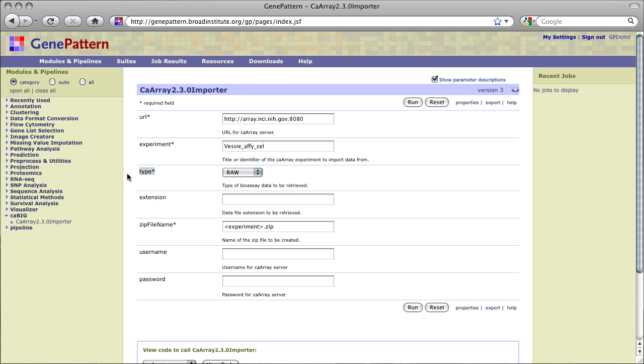Type refers to the type of bioassay data to be retrieved, raw or derived. The default is raw and will likely be correct for most data imported from CA Array.